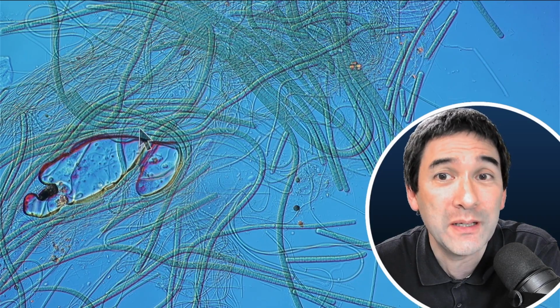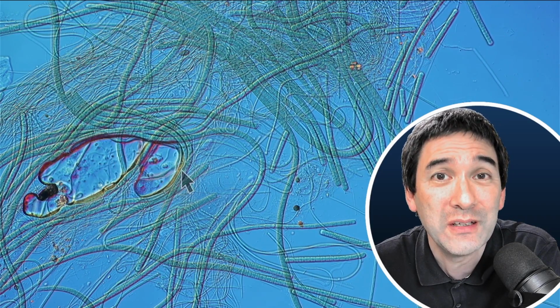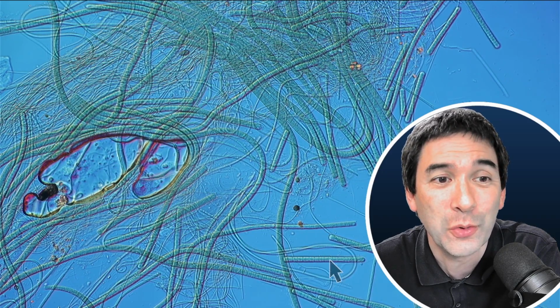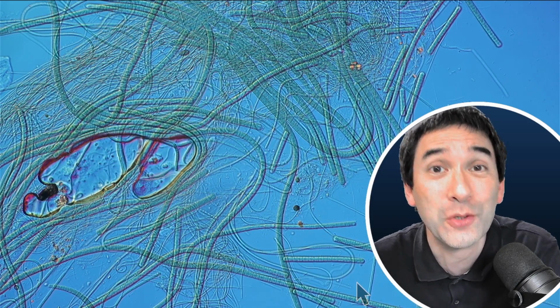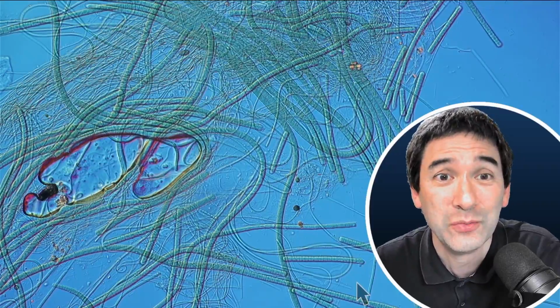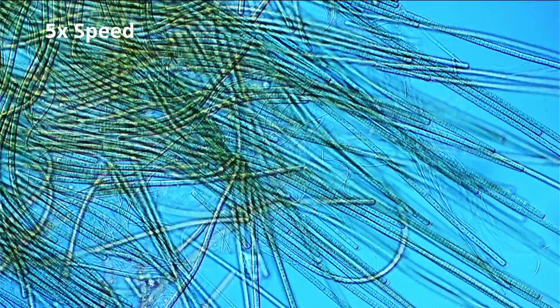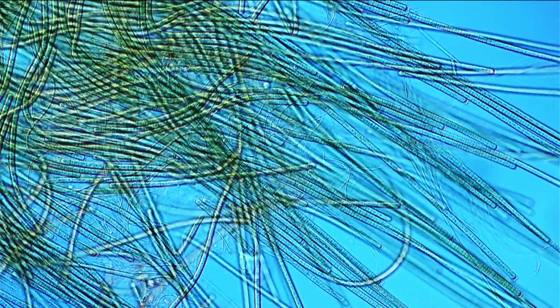So those cyanobacteria here, they are producing quite a bit of oxygen here, and you can see actually that this bubble is starting to grow. Currently, this is not time lapse, but it's actually in real time. But I can of course also show you a faster version of their movement as well.